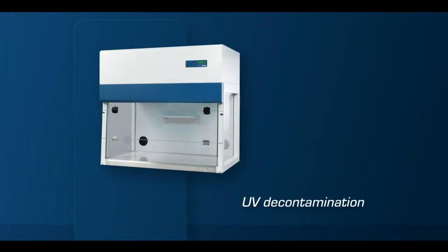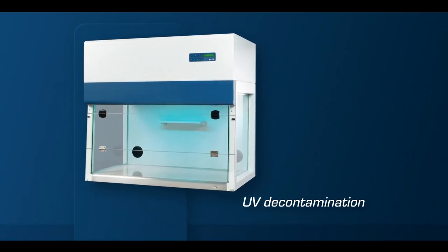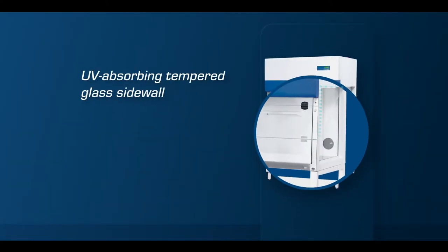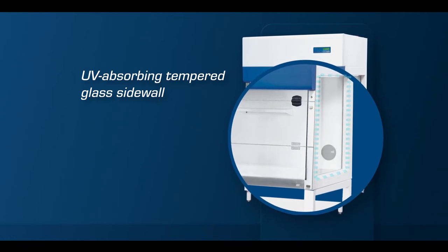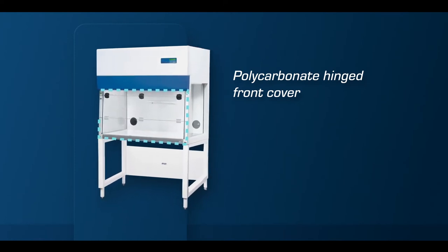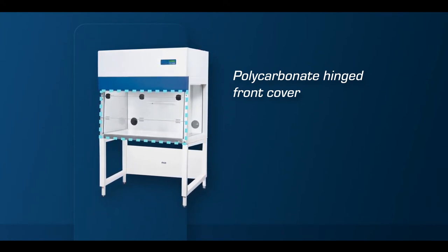The cabinet is also equipped with a UV lamp that inactivates random nucleic acid contamination. The cabinet's tempered glass prevents UV light from harming the laboratory staff. The polycarbonate hinged front cover also protects against UV light. It has an interlock feature to prevent accidental exposure.